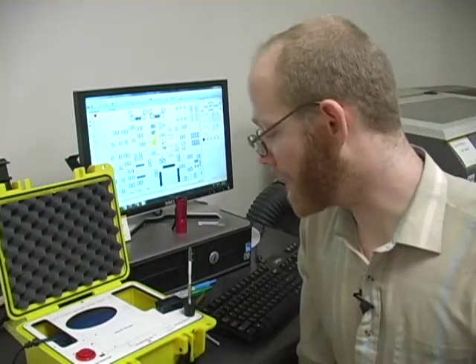So now this is going to run for 30 minutes, and at the end of that period of time we will check the levels.